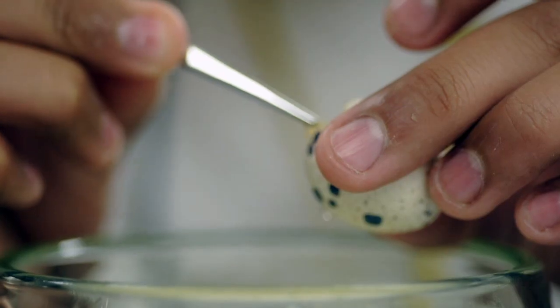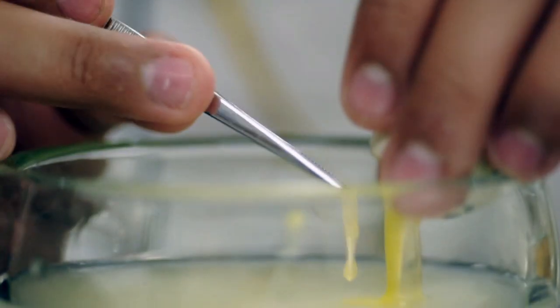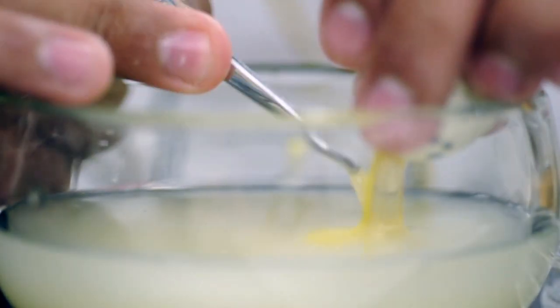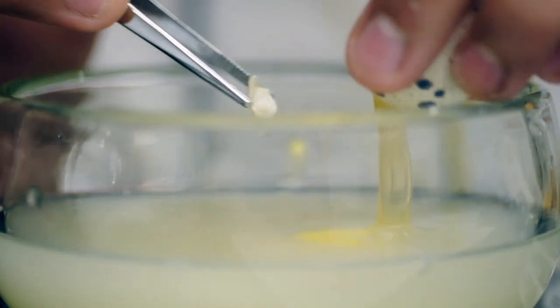The yolk would be first, and the embryo would be up under the yolk. So I had to get all the yolk out — and there was a lot of yolk — and then get the embryo out, which was pretty difficult because it didn't want to come out at first.